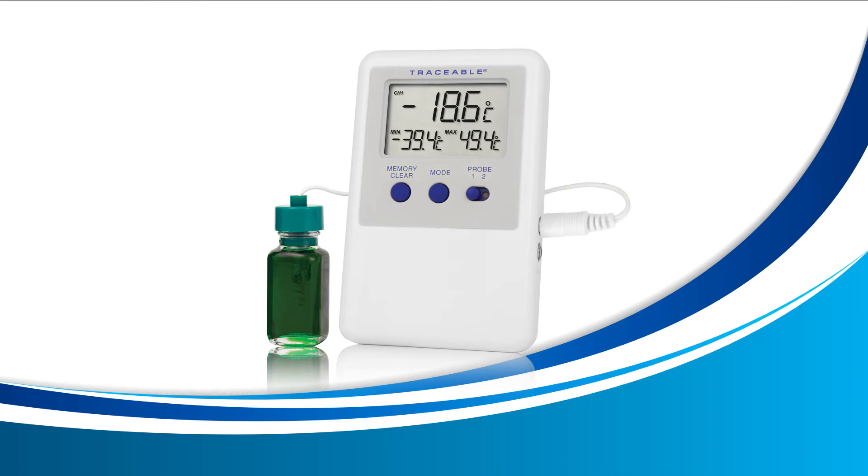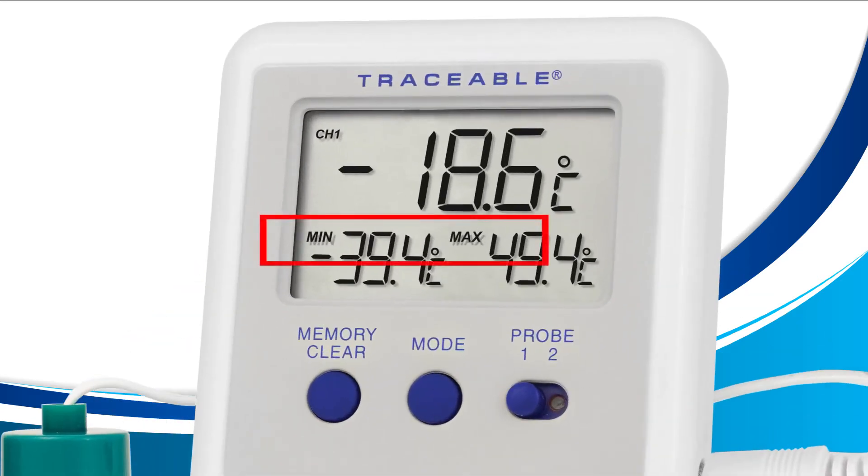Clearing your min and max. Now that we know how to display your min and max, it's time to learn how to clear them. For this lesson, we're going to use the mode button and the memory clear button located on the front of your device. First, press the mode button on the front of your device until your screen displays the words 'min' and 'max' as shown.